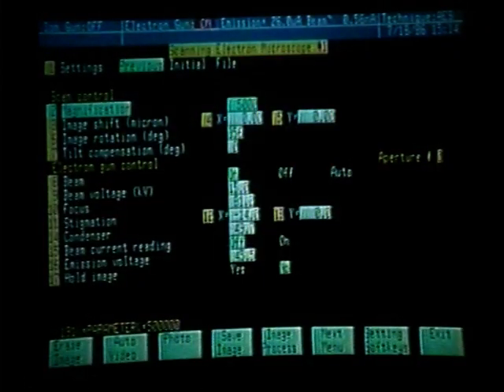So now that we are setting up for a photo, let's make this registration mark so that we can be consistent and reproduce the exact same area. To document this area, let's begin with a lower magnification photo of the area. Let's start with a magnification of 200x.